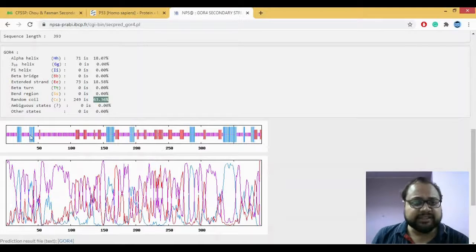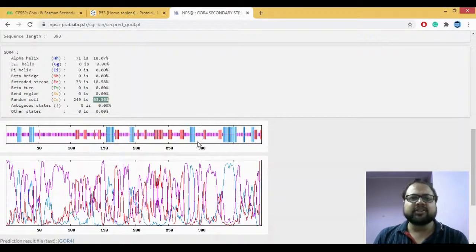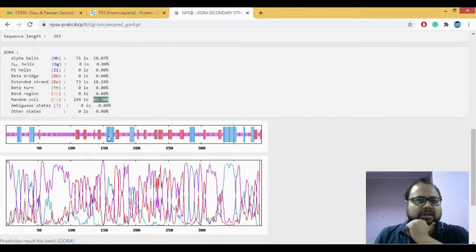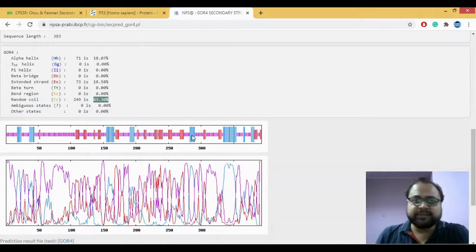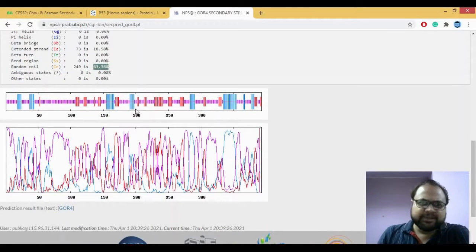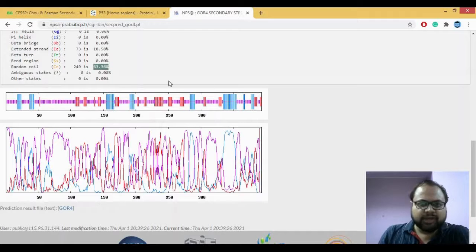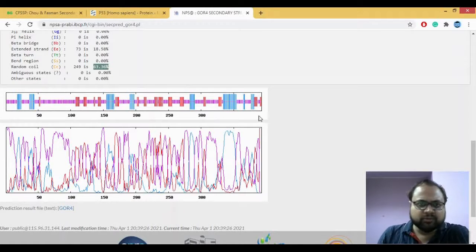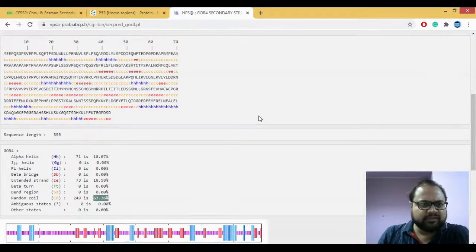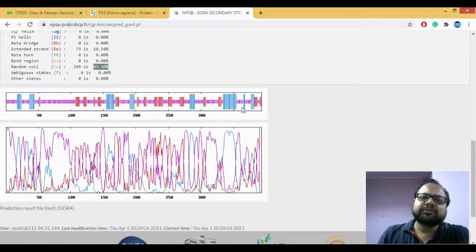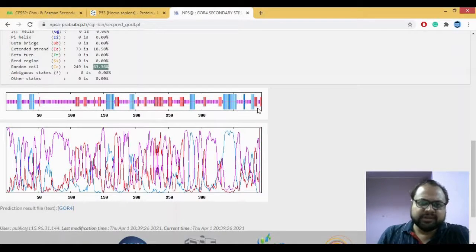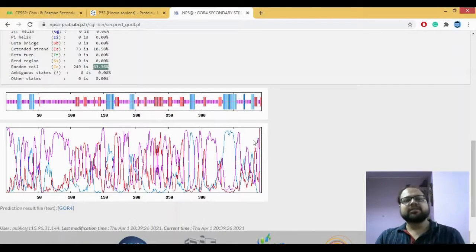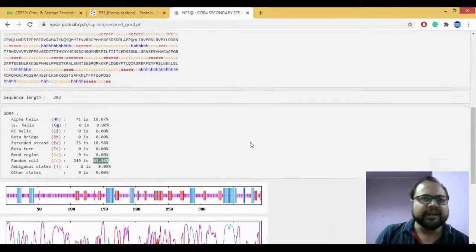This gives us what is the graphical representation. How many coils, how many alpha helices or beta sheets spread by that. This just gives you another representation of how this thing works. It tells you how the different coils are around the different beta sheets in this case.